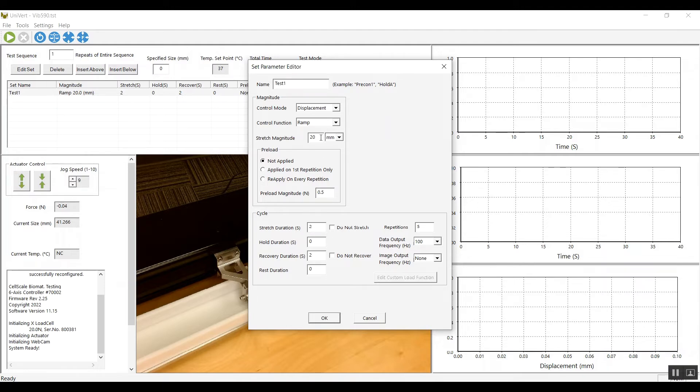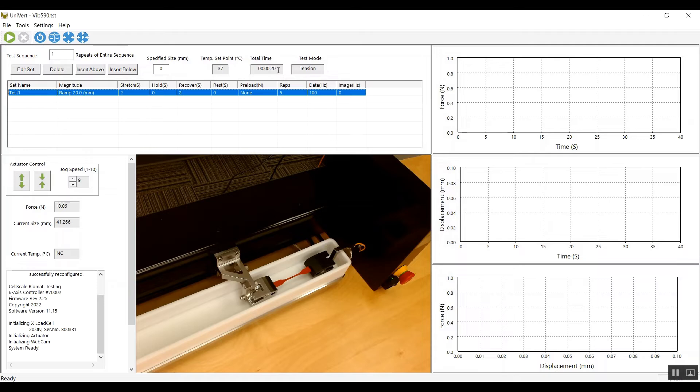I'm going to stretch it by 20 millimeters in two seconds, recover in two seconds, and repeat that five times so that my test duration is 20 seconds.